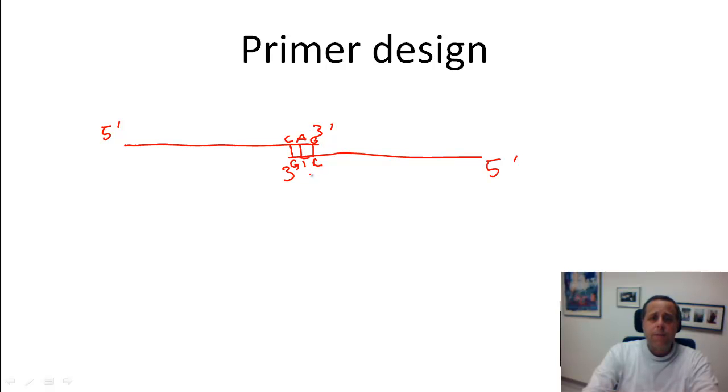So that kind of scenario will lead to primary dimerization because if then the polymerase comes in, what happens is that the primary mass will be filled in like that, and from now on this is a wonderful template for all of your subsequent reaction steps. So now this will be amplified and this will be in competition with the PCR product that you're really trying to amplify.